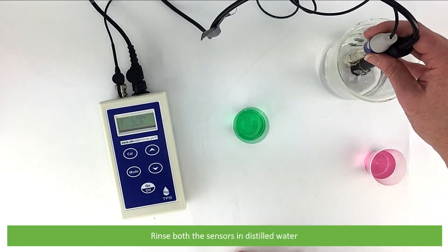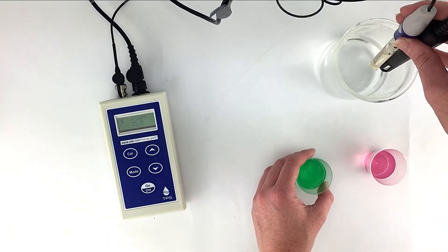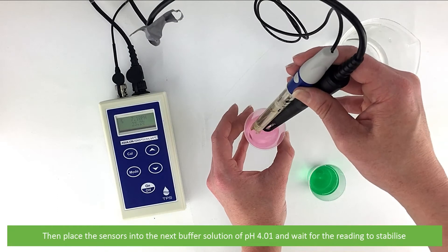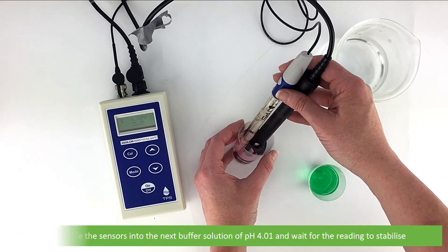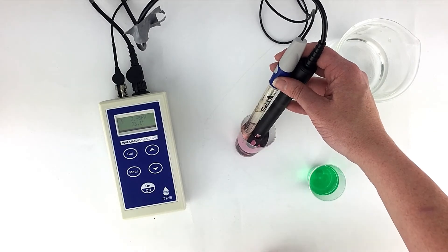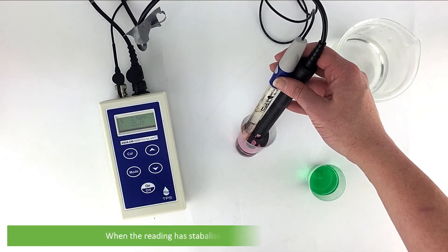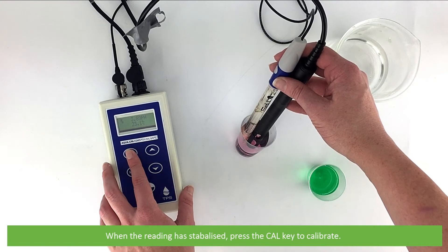Rinse both the sensors in distilled water. Then place the sensors into the next buffer solution of pH 4.01 and wait for the reading to stabilize. When the reading is stabilized, press the CAL key to calibrate.